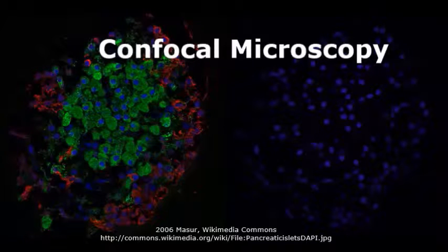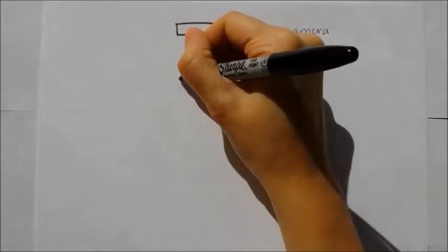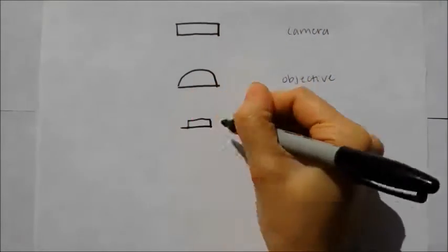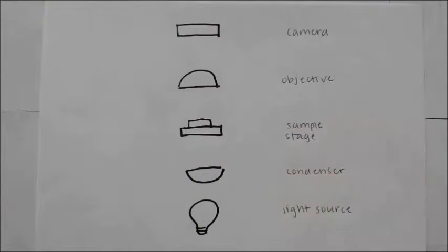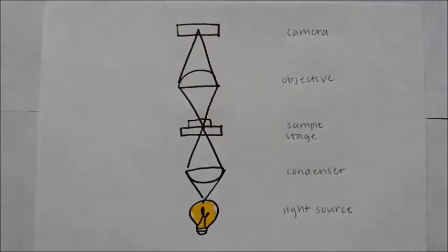Optical imaging is a non-invasive imaging technique that utilizes visible, ultraviolet, and infrared light waves, which allow us significant insight into various types of samples. An optical microscope is an imaging instrument that utilizes visible light waves to illuminate a sample which sits on the stage just below the objective, a small lens that brings the image of the sample into focus at a short distance. The image is acquired similar to the way a camera takes a picture, meaning the whole field of view is recorded at once onto a grid of pixels.